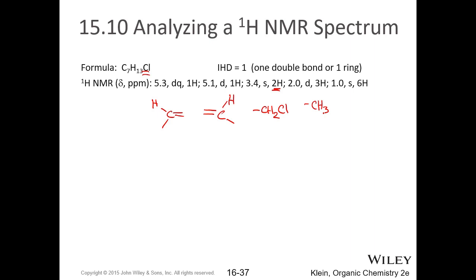So we have what, a CH6? Nope. What do we have? Probably 2 methyls. So these are the pieces in our molecule. Question is, how do we put them together? Of course, another question is, do we have everything?